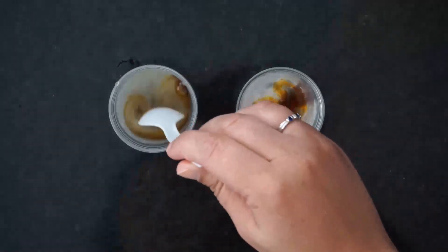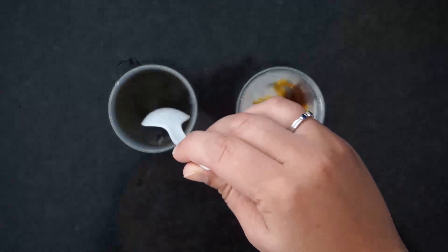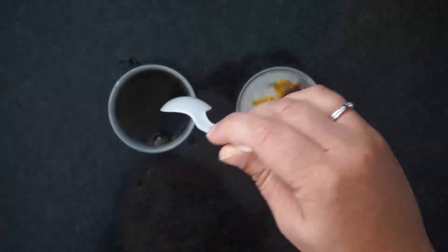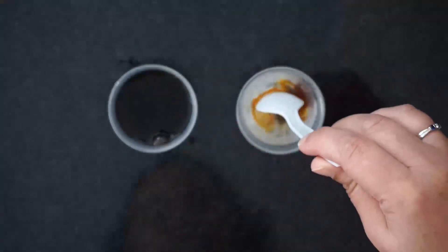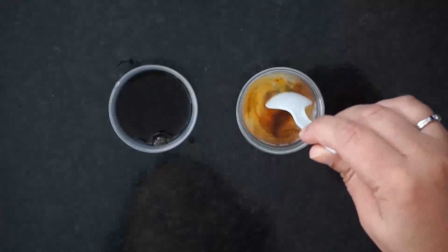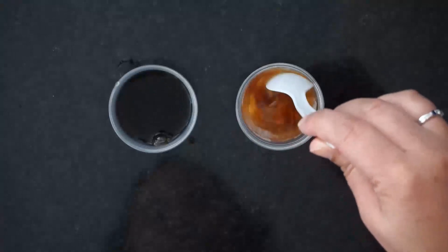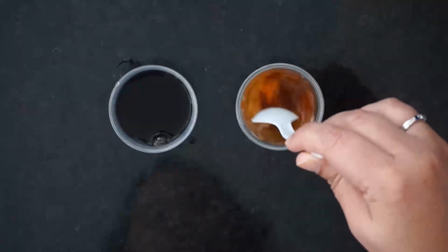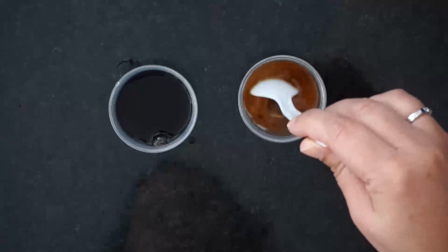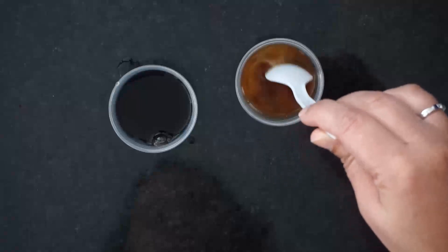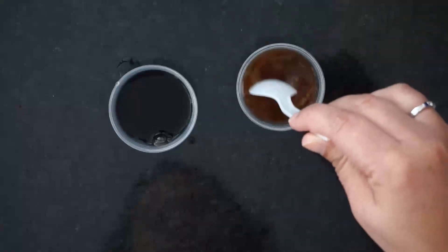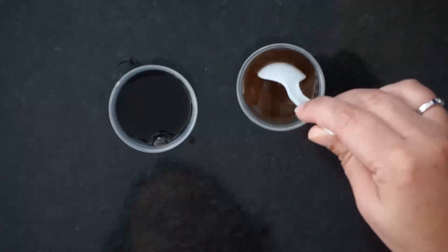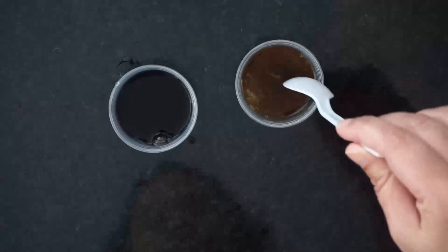Start with the one on the left that doesn't have saliva in it so that you don't contaminate that one. Give them both a good stir. When you're finished, wait one hour and then check them again.